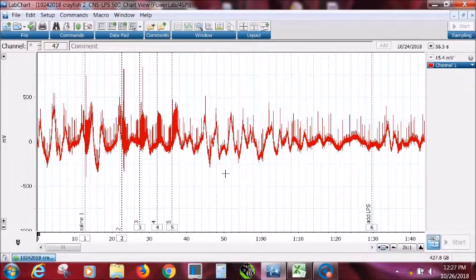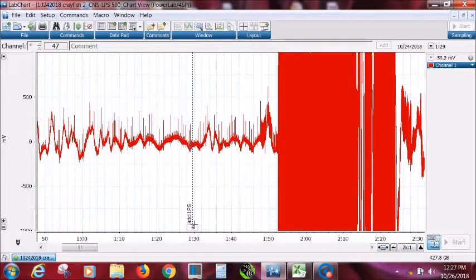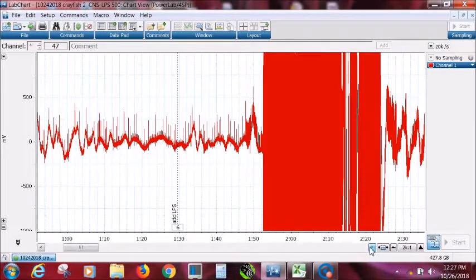Alright, so we do saline first, and then on a file, it probably will say something like add LPS or add whatever concentration of LPS. In these files, the first ones we're doing, the name of the file has 500 in it. That means it's 500 micrograms per mil of LPS in the crayfish saline.